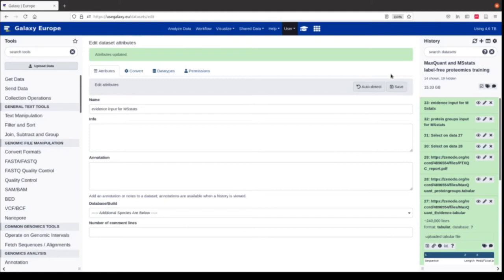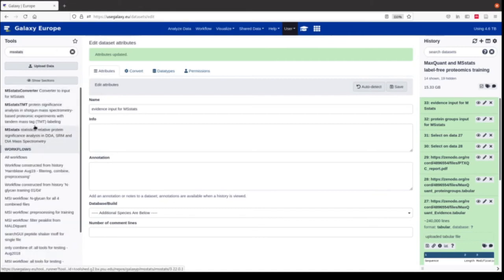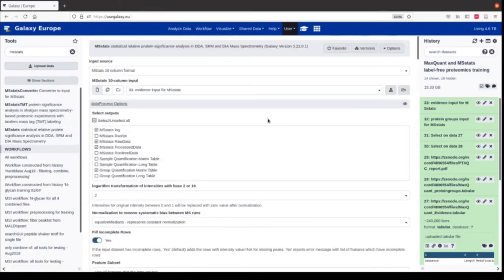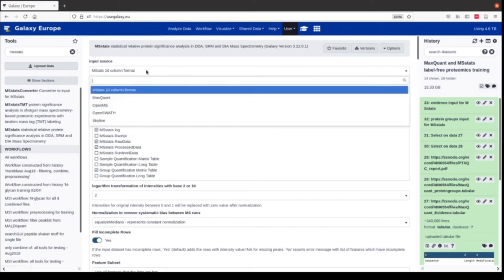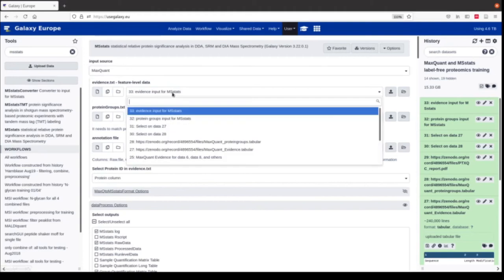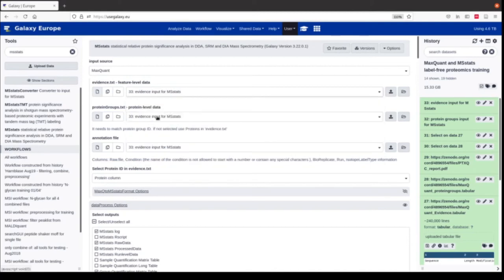Now everything is prepared for MSStats. We can either search for MSStats here or directly click on it in the training material. There are two types of MSStats: MSStats TMT is for labeled data, and we use this MSStats version which is for label-free data. We first need to specify the input source — we have MaxQuant as input. Now we need to provide the evidence and the protein groups. Of course we could use the ones obtained from MaxQuant, but this would remove all potential contaminant proteins, so here we use our filtered and manipulated inputs.